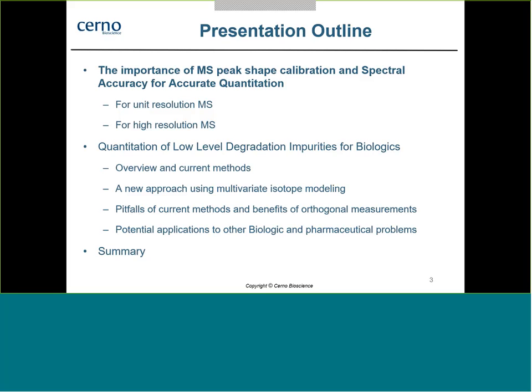And finally, we're going to look at the application of this mixture deconvolution to other biologic and pharmaceutical, as well as environmental problems. And then we'll wrap it up in the end as a summary.